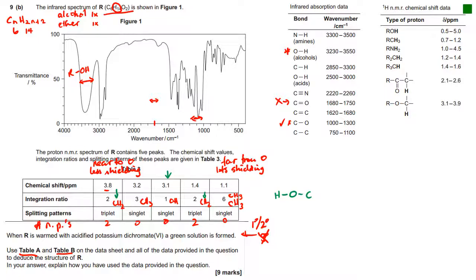So that suggests to me straight away that these two CH2 groups are connected to our alcohol oxygen here. Before we actually write those down, let's check our chemical shift values. We've got 3.8, so we could have a look at this one. Is that consistent? Yes. And is our 1.4 consistent? So 1.4 can't be this one, can't be this one, has to be this one. That's just a CH2 connected to another carbon, so that is consistent.